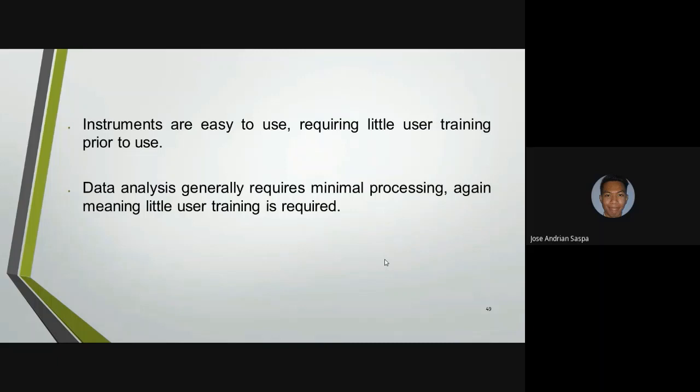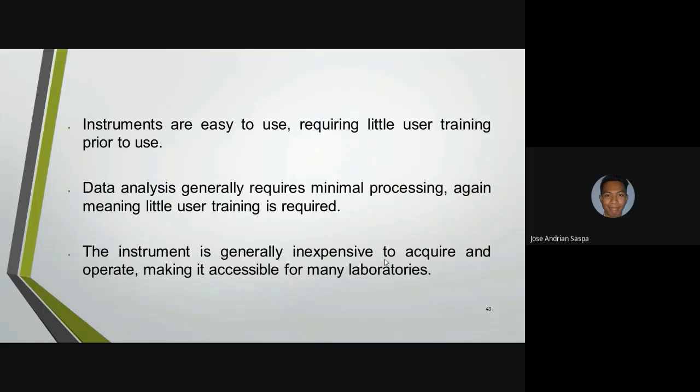Data analysis generally requires minimal processing, again meaning little user training is required. And the instrument is generally inexpensive to acquire and operate, making it accessible for many laboratories.